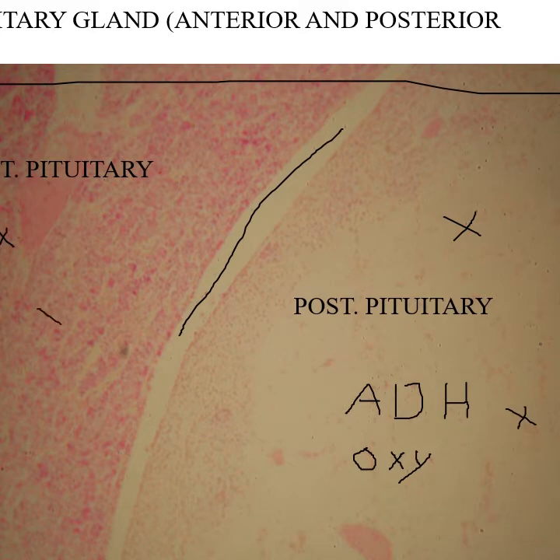Now, over on your left, the anterior pituitary, again, that does develop from the epithelial tissue lining the Rathke's pouch or oral cavity of the embryo. It's not modified nervous tissue like the posterior pituitary. So it stains more darkly, a lot more nuclei, picks up a lot more stain. So it's usually much more obvious.